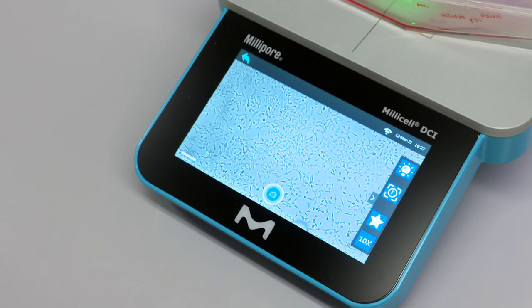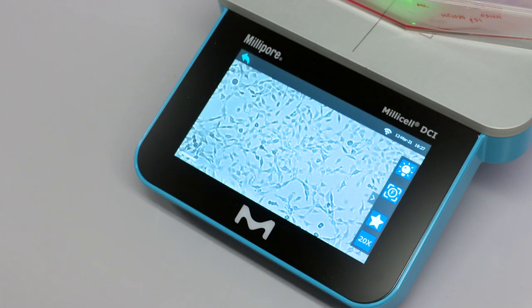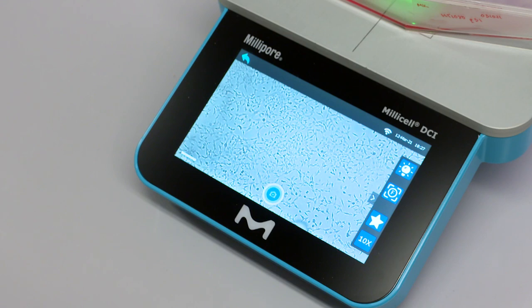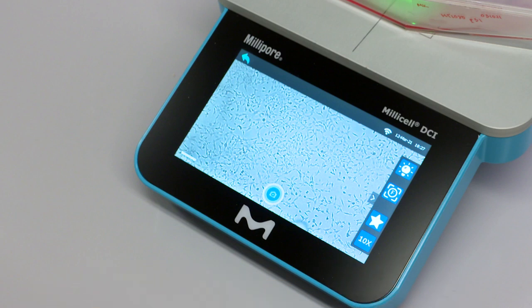Digital zoom can be achieved by clicking on the 10x icon. To return to 10x magnification, click on the 20x icon. Note that analysis is only available at 10x magnification. To capture an image at 20x, use the quick capture mode.